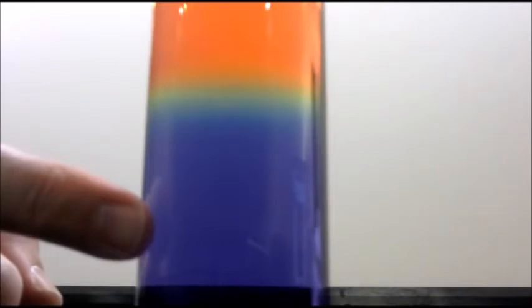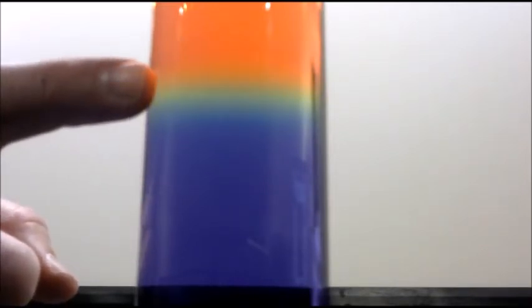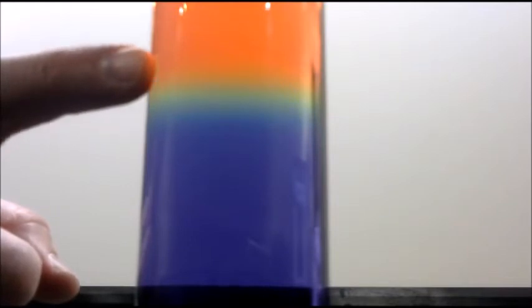As you can see, we've got some pretty cool colors here. We've got purple down at the bottom, and then blue, kind of thin layers of green, yellow, orange, and then up at the top, we've got our red. That's our pH rainbow.